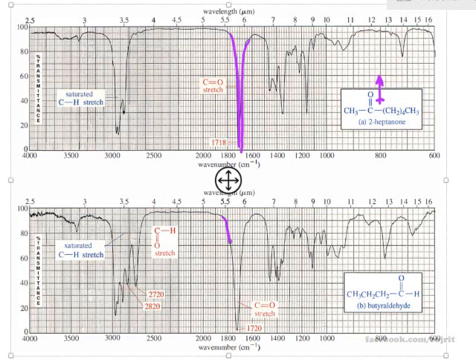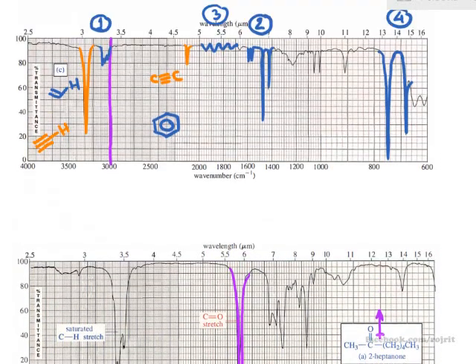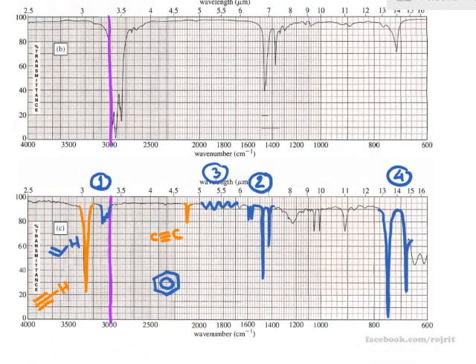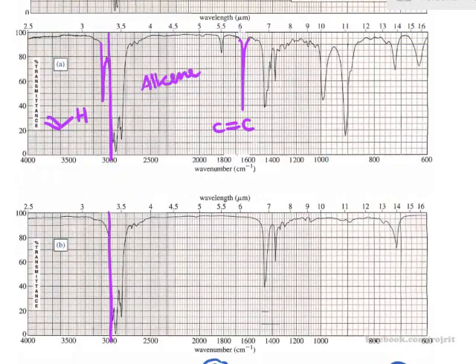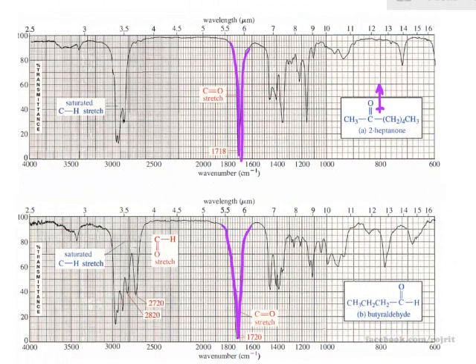And yeah, for aldehyde as well, this strong absorption appears at around 1700. So a little bit higher than the carbon double bond of the alkene, right? But what you can see here is a very strong absorption compared with the alkene and the benzene ring, where the absorption is not very strong. This is very, very strong, so the percent transmittance drops down to almost 0.